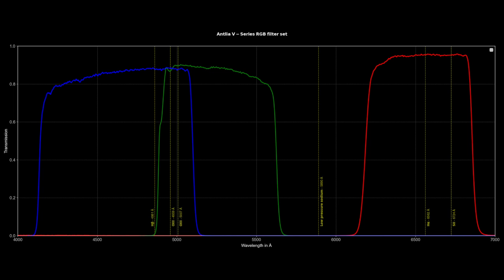What I find slightly disappointing with these Antlia RGB filters are the transmission numbers for the blue and the green filters, especially when Antlia claims that they can achieve 98% transmission. This made me think that I may want to switch those to a different brand.